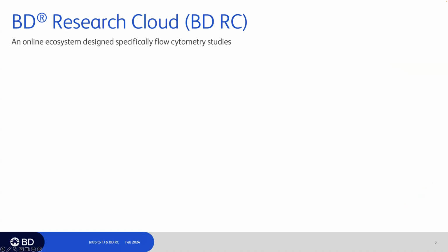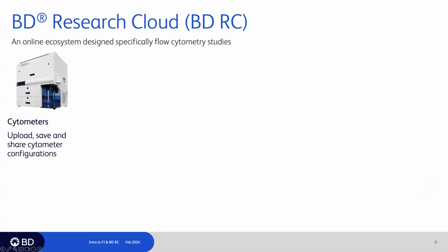So BDRC is just our online ecosystem designed for flow cytometry studies, and a great way to collaborate with teammates or colleagues in your labs. In BDRC, you'll have access to cytometers where you can upload, save, and share cytometer configuration files.